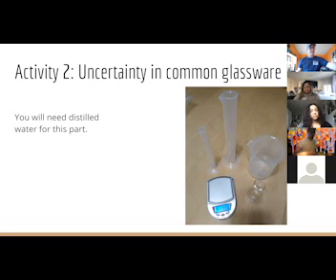So that is the actual temperature of the water, because the temperature is going to change, obviously. If I took it out of the fridge when it's at 4 degrees, an hour later, obviously it's not going to be 4 degrees anymore. And we need to know what the temperature of this water is. So you need to let it sit for at least half an hour.